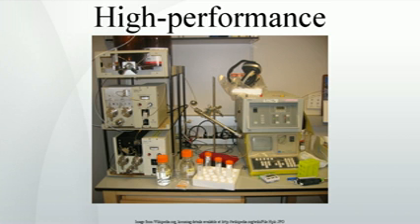Very polar solvents such as traces of water in the mobile phase tend to adsorb to the solid surface of the stationary phase, forming a stationary bound, water, layer which is considered to play an active role in retention. This behavior is somewhat peculiar to normal phase chromatography because it is governed almost exclusively by an adsorptive mechanism, that is analytes interact with a solid surface rather than with a solvated layer of a ligand attached to the sorbent surface. See also reversed phase HPLC below.